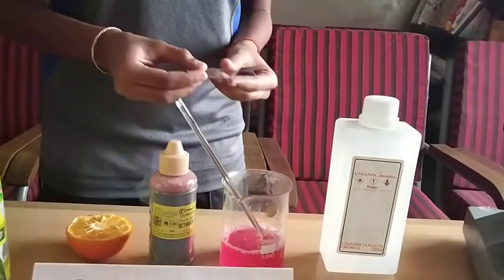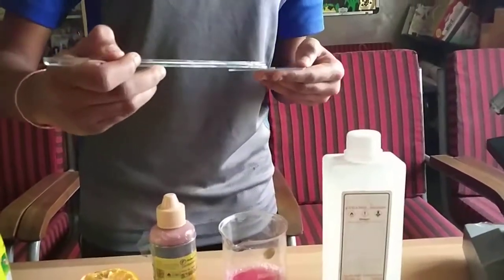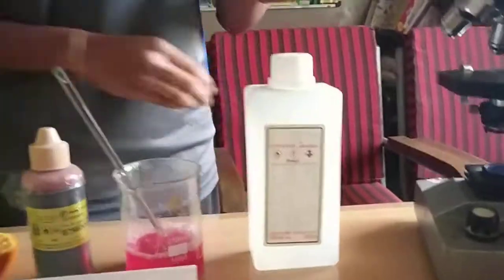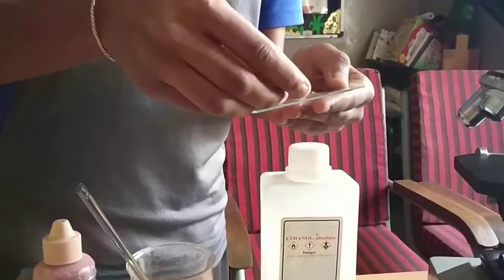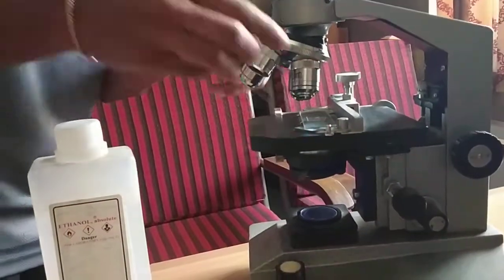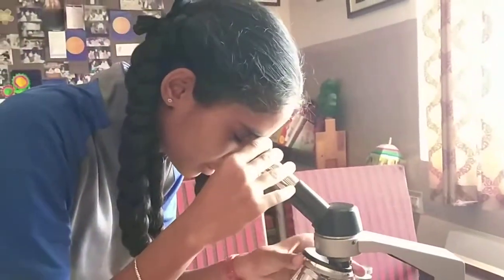I am taking a glass slide. I am putting the DNA on it and closing it with another glass slide. Then I am placing it under the microscope. Slowly we can identify and see it more clearly through the microscope.